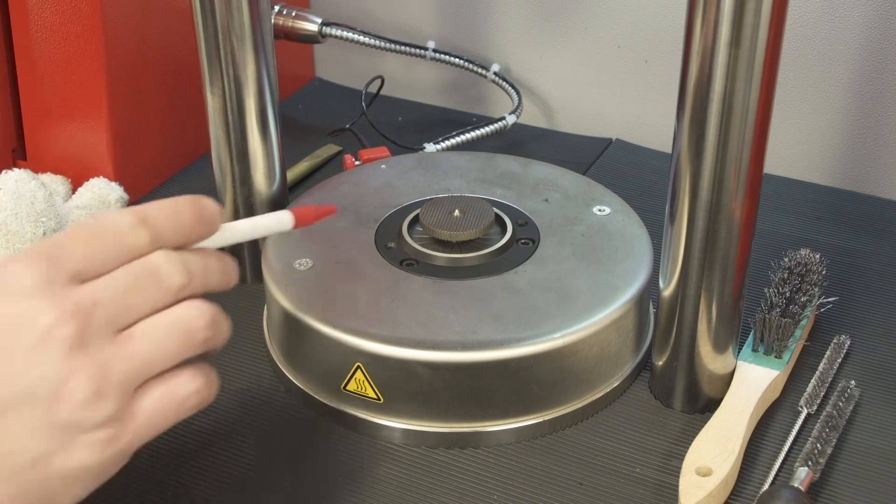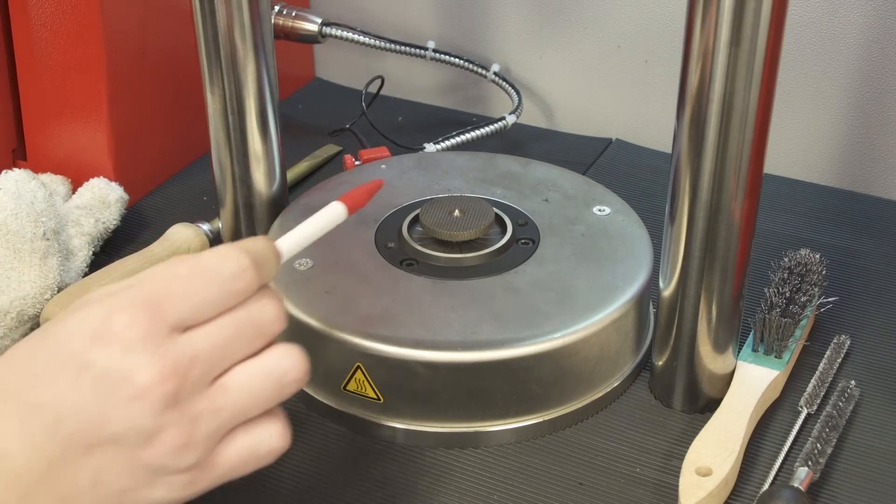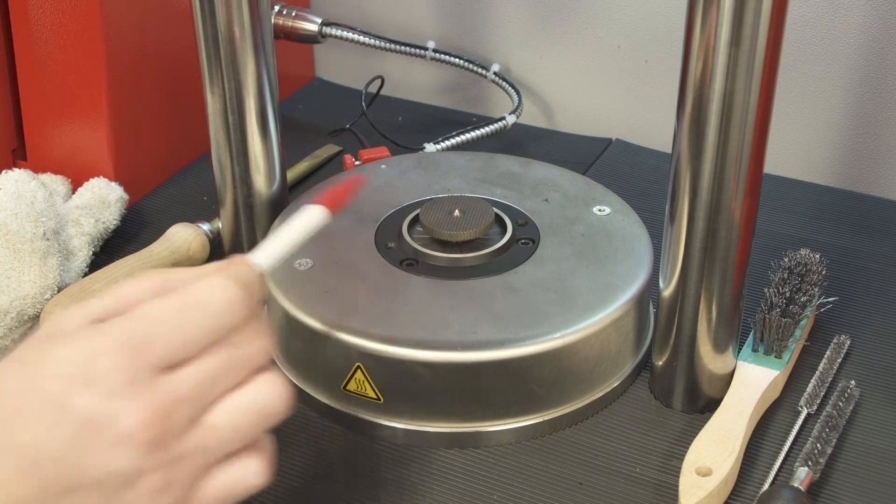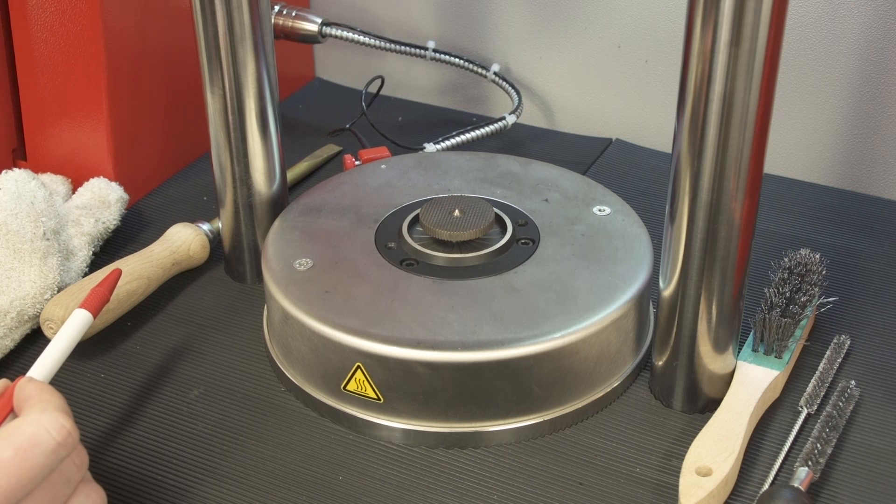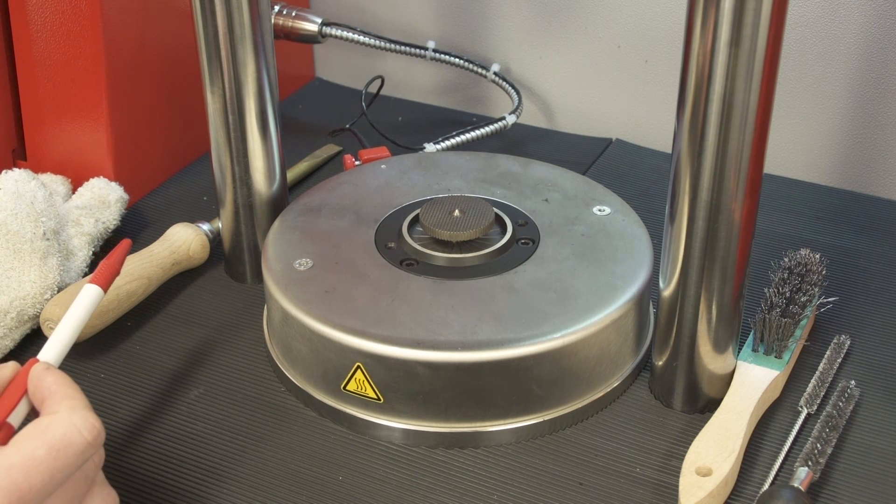A Mooney viscometer consists of a heated lower and upper die as well as an embedded rotor. The rotor is turning with a predefined speed according to international standards, typically 2 rpm.